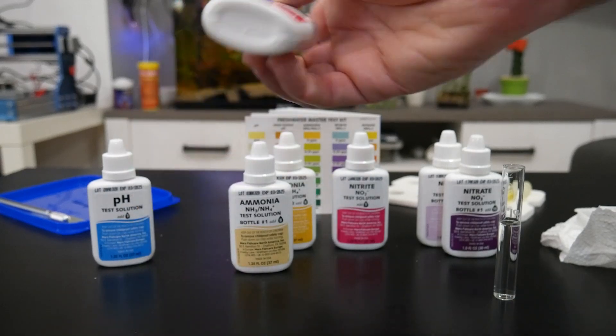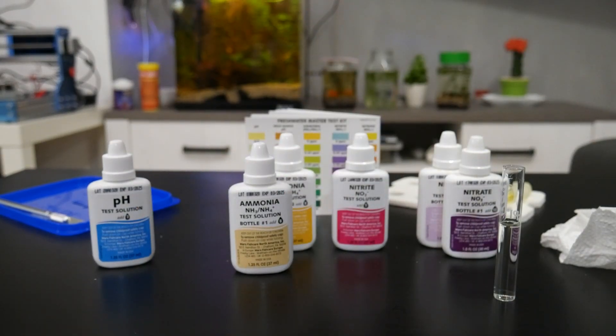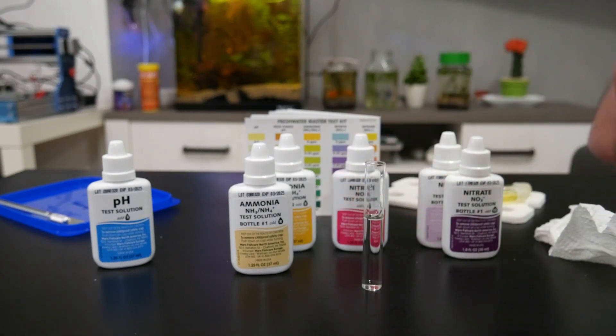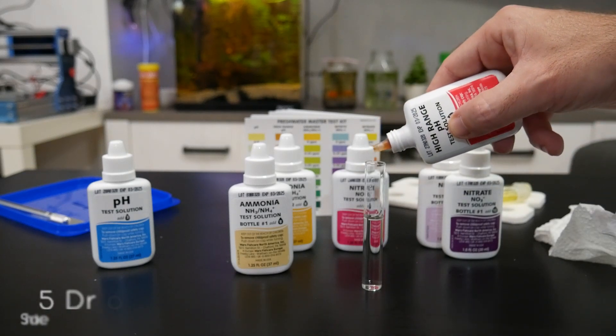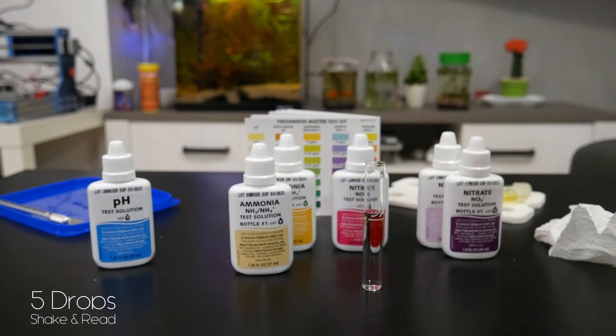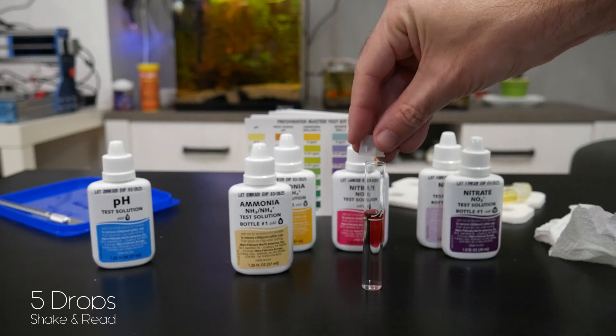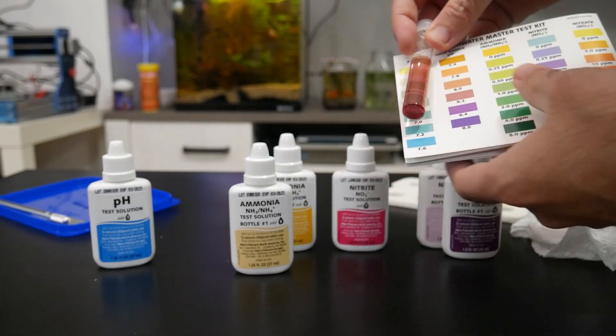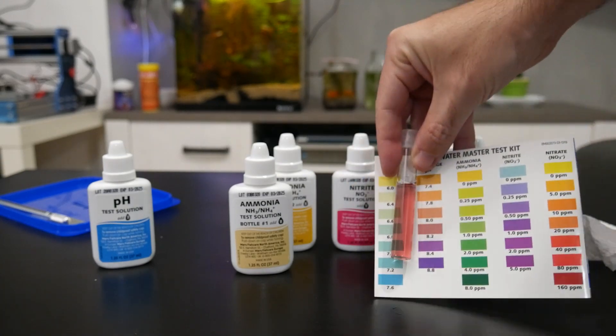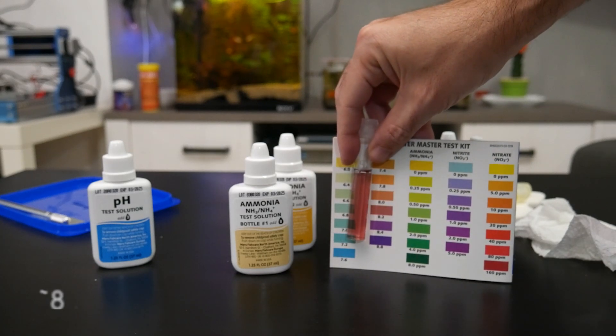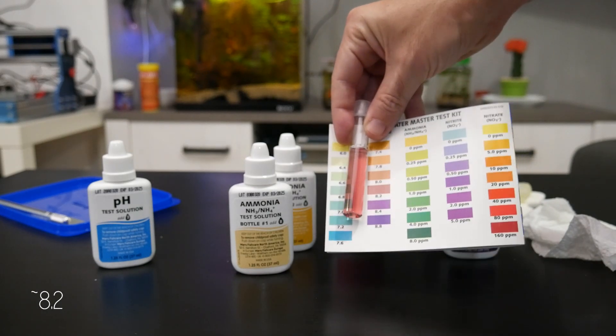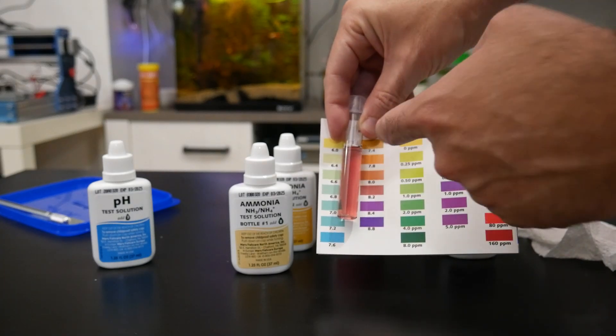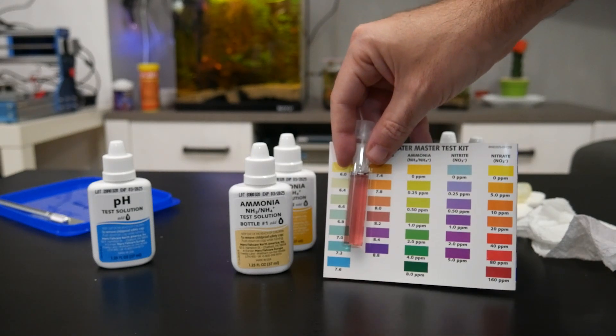Now we will test the high range pH. We need five drops from this bottle and we can read it immediately after the test. If we check the table, we can see that the value is between 8 and 8.2. The value is quite high, but if the fish are happy, this value is okay.